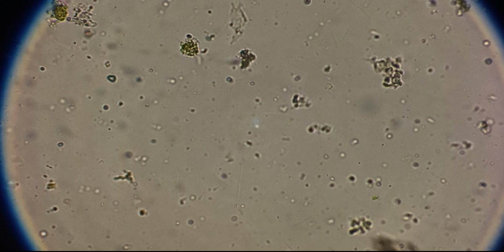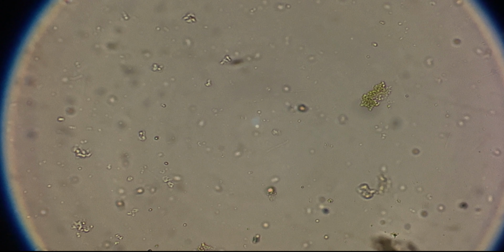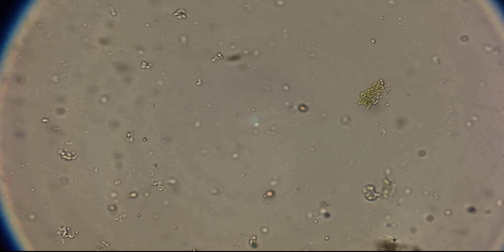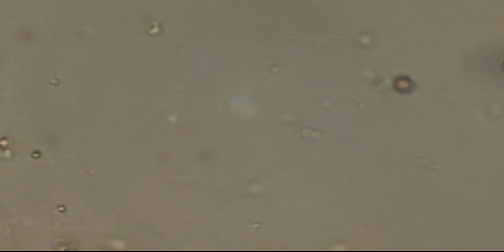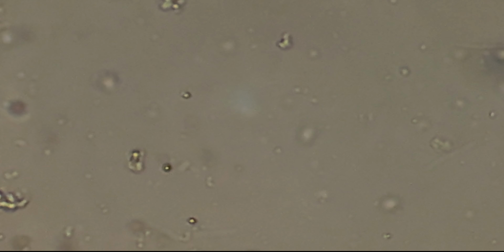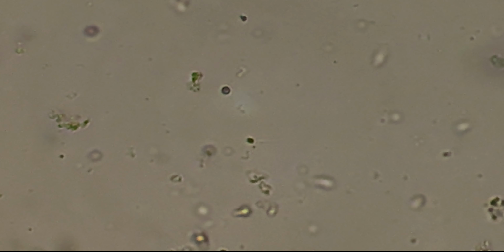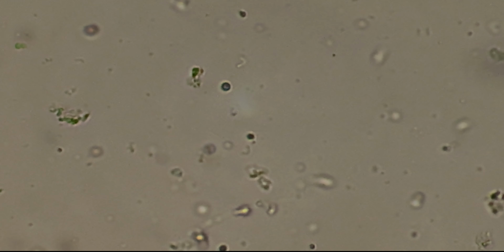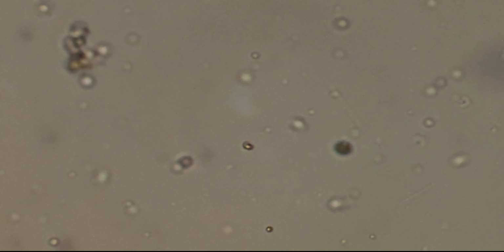That's actually one of the wildest parts of doing microscope experiments like this. It's rarely instant. It's rarely all or nothing. You get these little moments of resistance, tiny bursts of movement from organisms that are clearly under stress, but haven't fully shut down yet. It's honestly kind of beautiful, watching something so small put up a fight we can barely see with the naked eye.